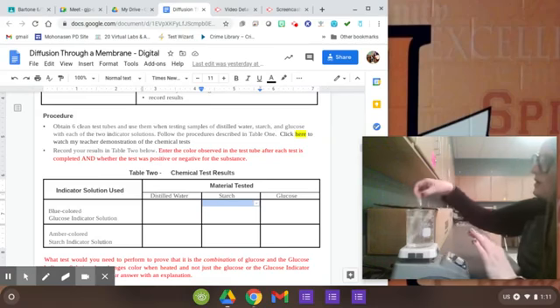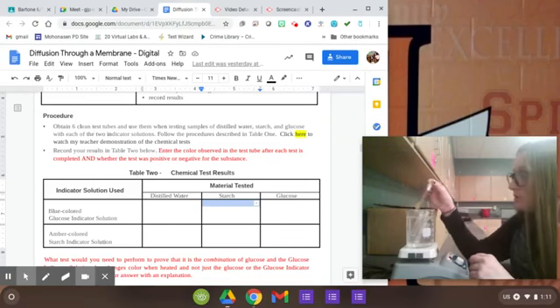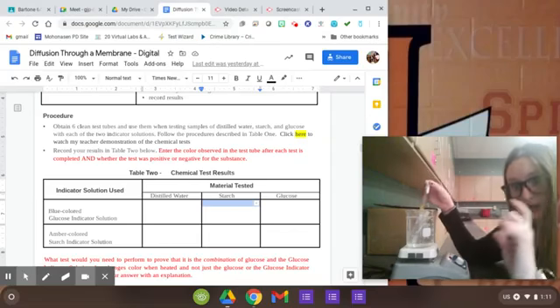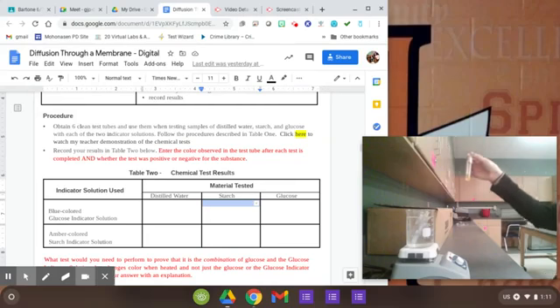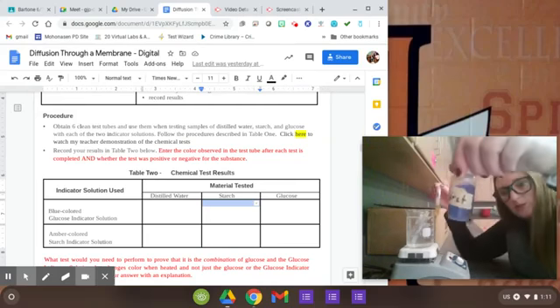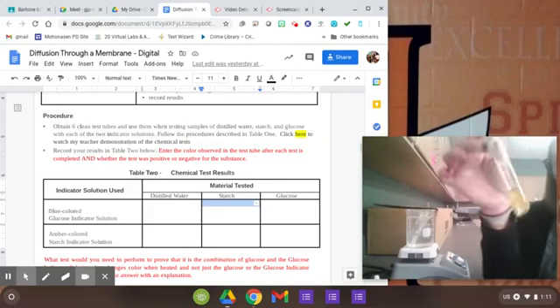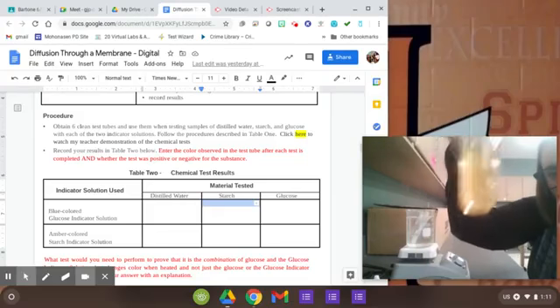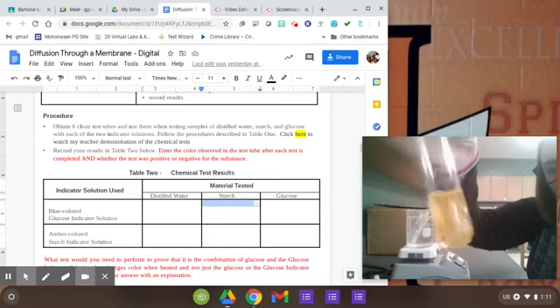Okay. And then the last one, which is where we should see the positive reaction because it's glucose with glucose indicator. It was a light blue because that's what color the indicator is. Remember the indicator looks like this. It's that light blue color, okay? So when I put it in, it should have stayed light blue if it was negative. And it's a little hard to see in the camera, but it is turning this orange color.